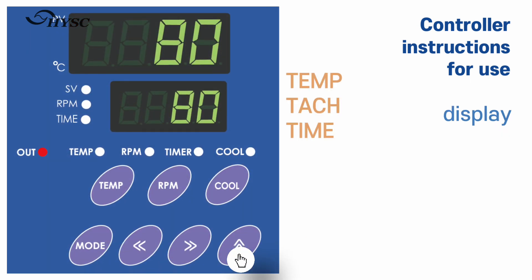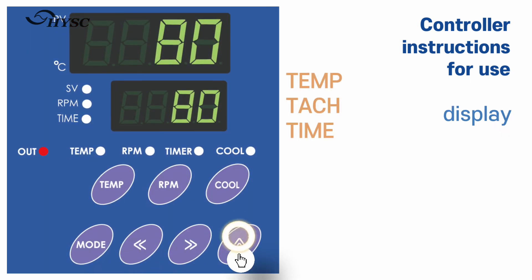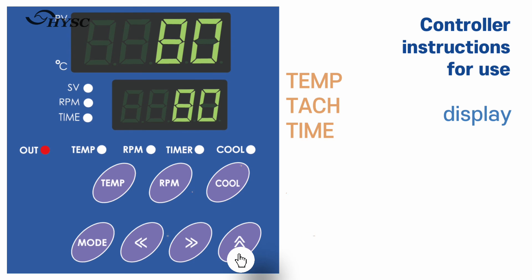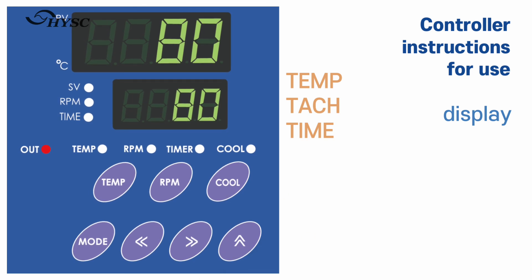Each time pressing the upper key, temperature, speed, and time will be displayed on the under screen in sequence.